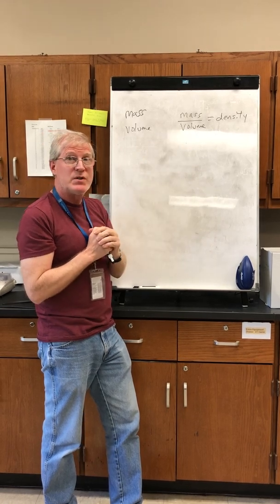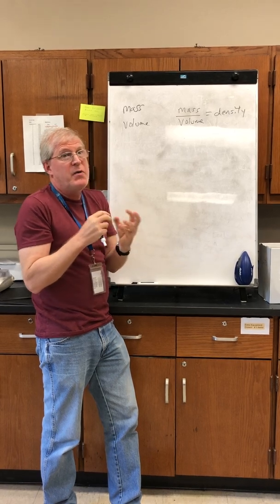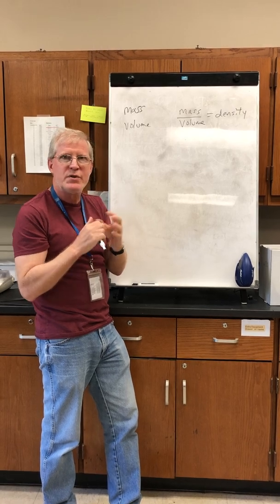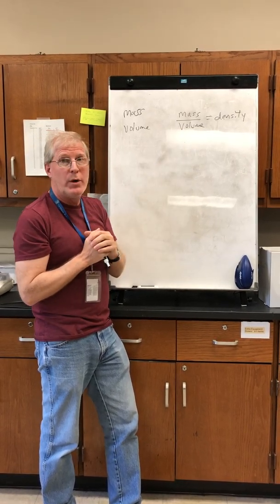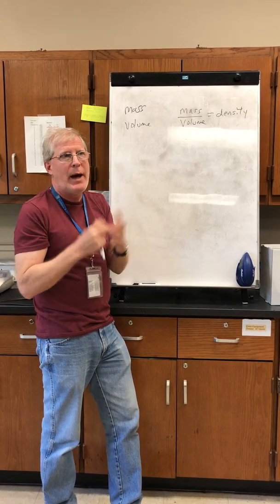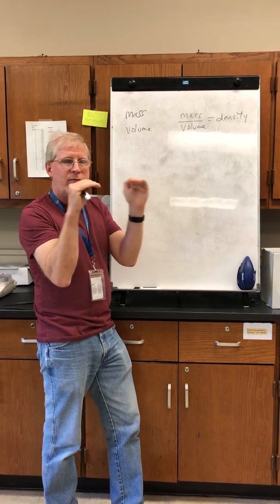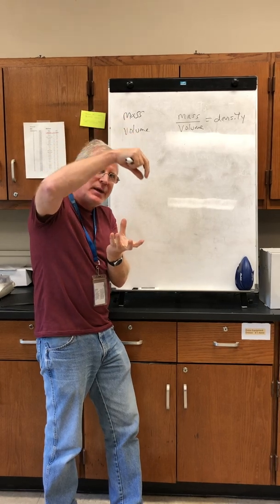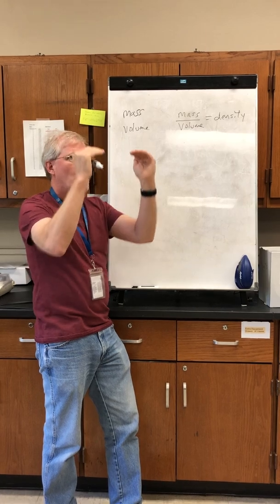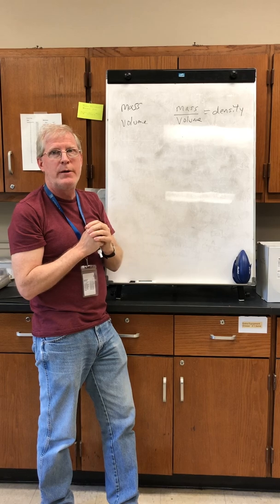To find the volume of a solid, how do we do that? If it's a sphere, a cylinder, or some sort of cube-like structure, you could maybe measure it with a ruler in some fashion. But the technique that we're going to use to find the volume is water displacement. So imagine having a container of water and you read the level of water in it, and then you put something in it, you would expect the water level to rise. And if we look at how much the water level rises, that displacement is going to reflect the volume of the solid that we put in there, okay?